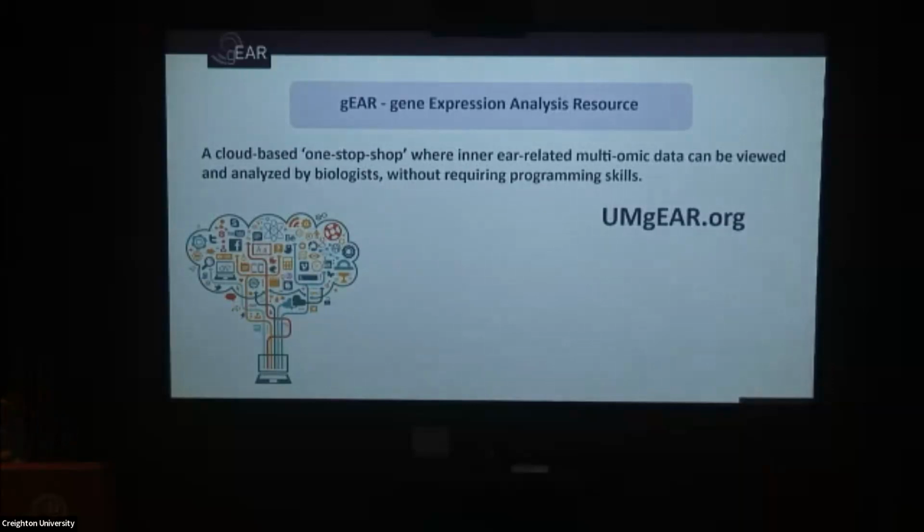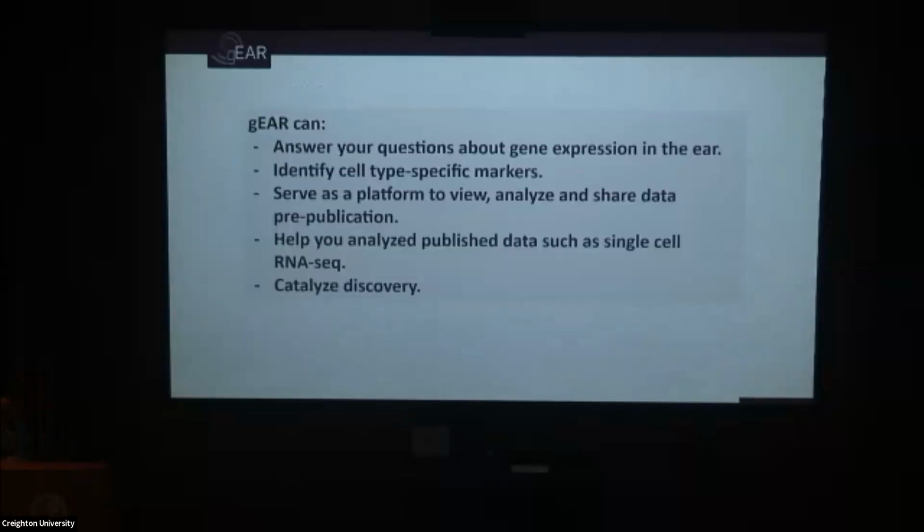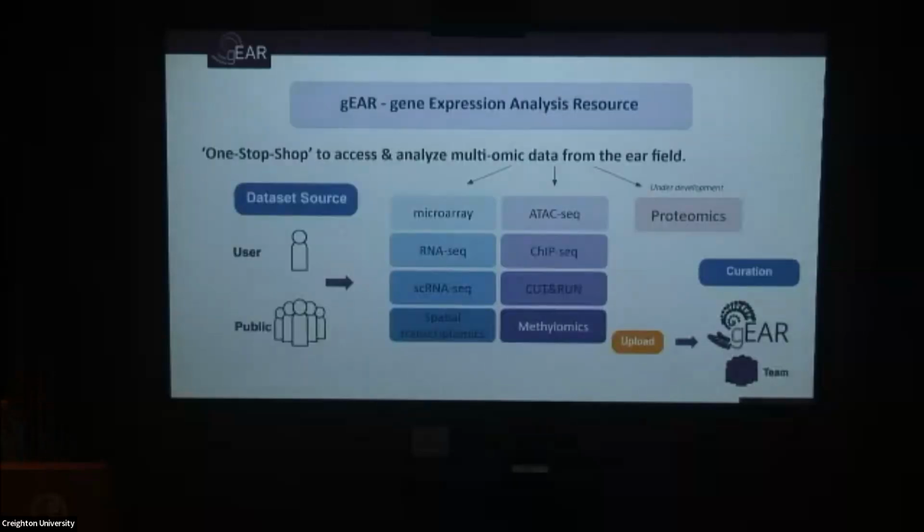Okay, so to back up a little bit, that's the data that is new and currently available on the gEAR, but let's just talk about the gEAR in general. We wanted it to be one place you could go to and see a lot of data sets side by side and access a lot of tools for those data sets, all in one place. The types of data we currently support or show on the gEAR can be uploaded by you. Anybody can upload them, or our team will help you upload them if you need it.